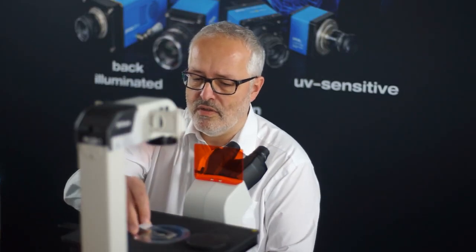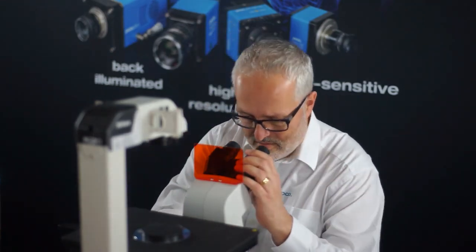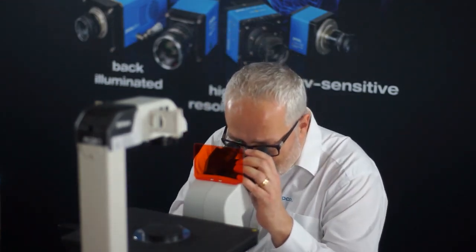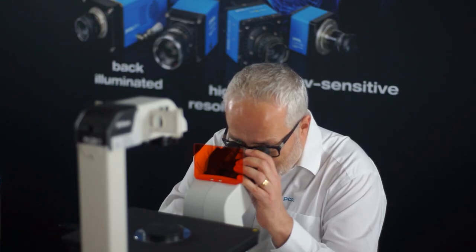And the procedure to do a measurement is very similar to the reference measurement. So you place this sample on your microscope, cover it, switch on the light, have a look, focus, and then select any area of interest to do the measurement. And when you've figured out the right spot, then the same procedure: you switch to the camera and have a look with the software, maybe refocus, and do your measurement.